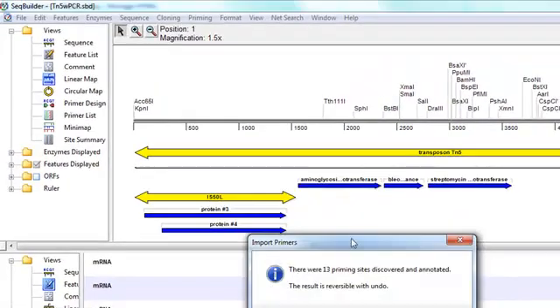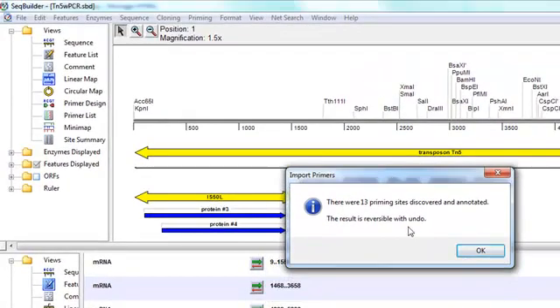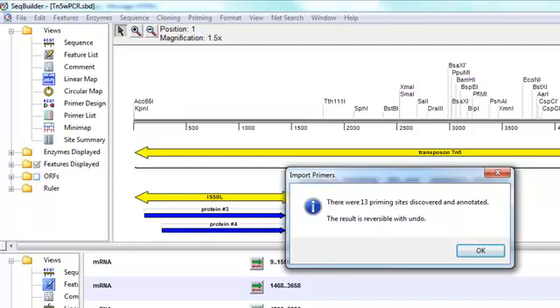And what SeqBuilder will do is attempt to locate each primer in the catalog on the current sequence by searching for sites on the template that match at least the 12-mer at the 3' end of the primer.